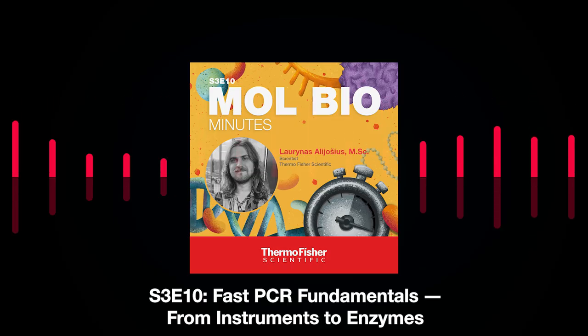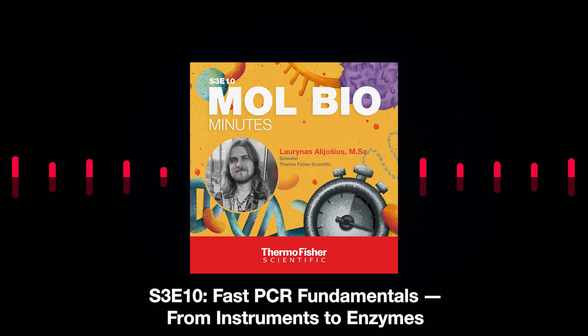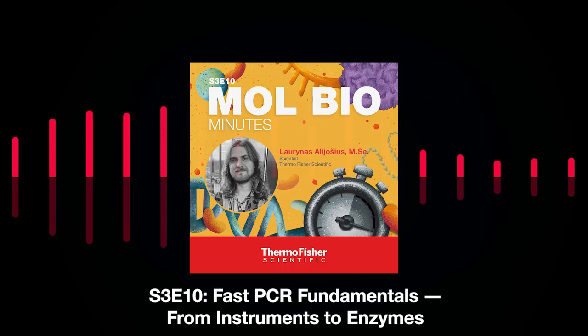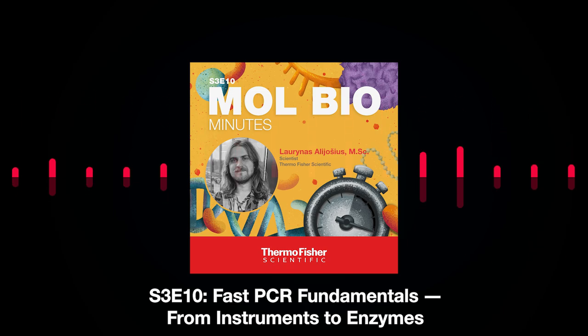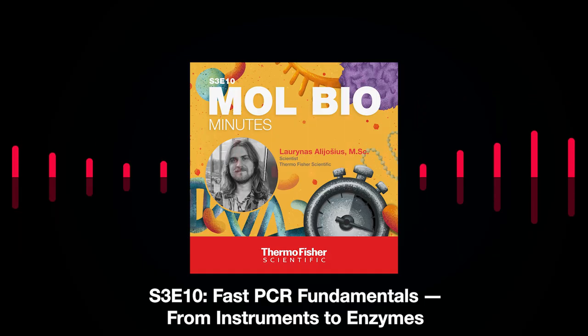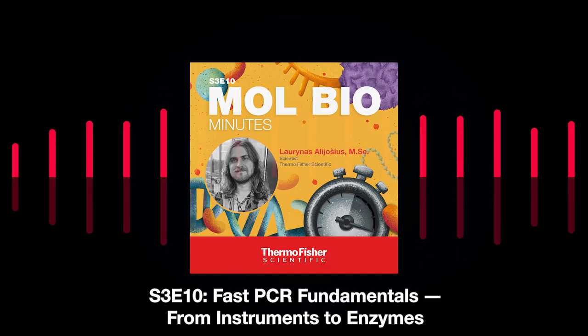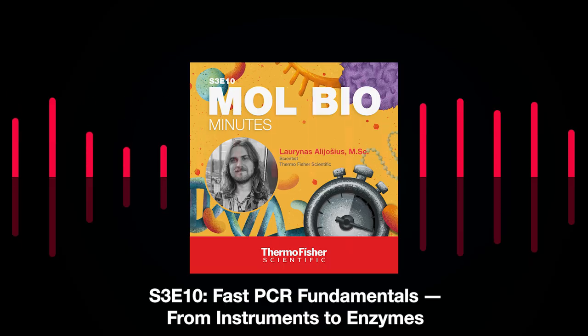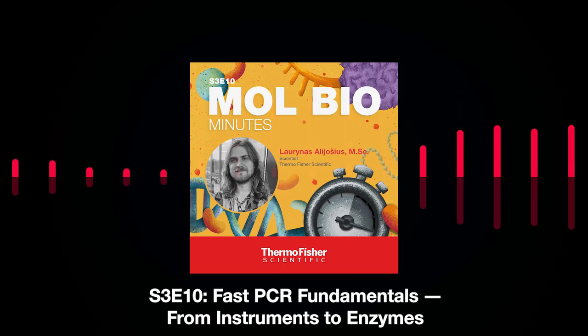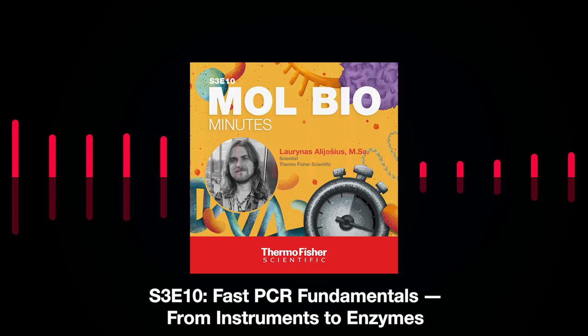And now let's move on to the main element of the PCR, the DNA polymerase. The DNA polymerases can be wild type, for example, traditional type DNA polymerases. They can be engineered ones. That means that they were changed from the wild type. For example, we have Platinum II Taq Hot-Start DNA polymerase.